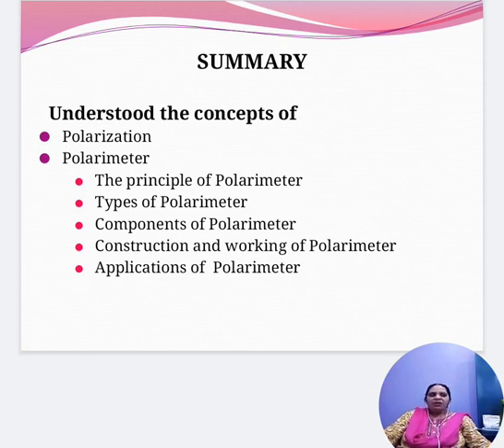We have the principle of polarimeter. It is nothing but a study of rotation of polarized light by transparent optically active substances. It is a type of qualitative and quantitative analytical technique, as both identification and estimation of the compound can be done using a polarimeter.